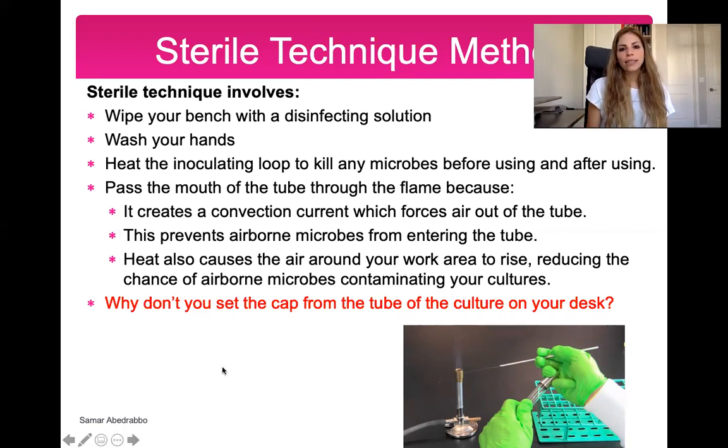And I always ask this to my students: when you're working with a culture, do you set the cap of the tube on your desk? And the answer should be no. You want to hold everything. You want to minimize contaminating the material you're working with as much as possible. So that's the sterile technique.